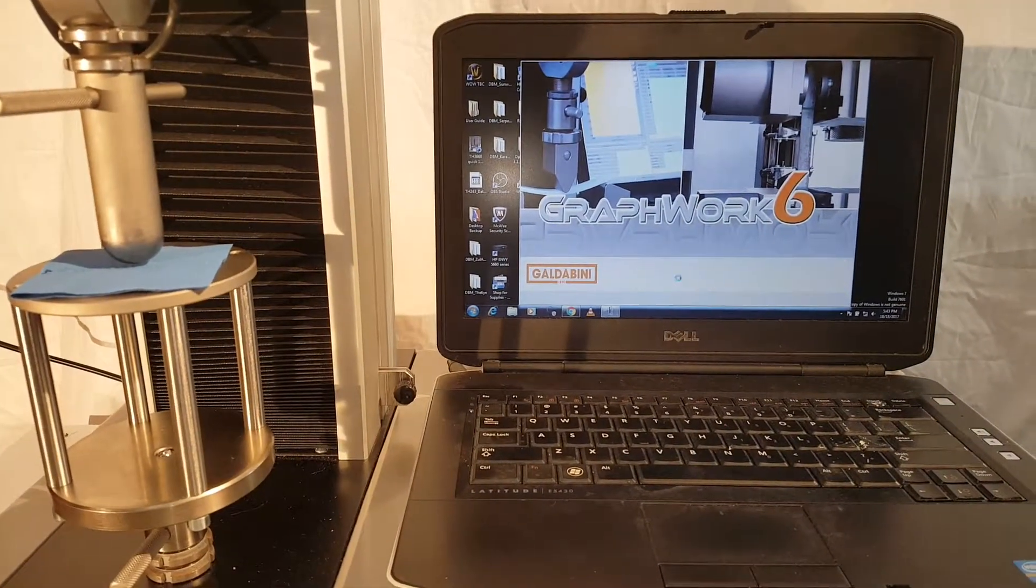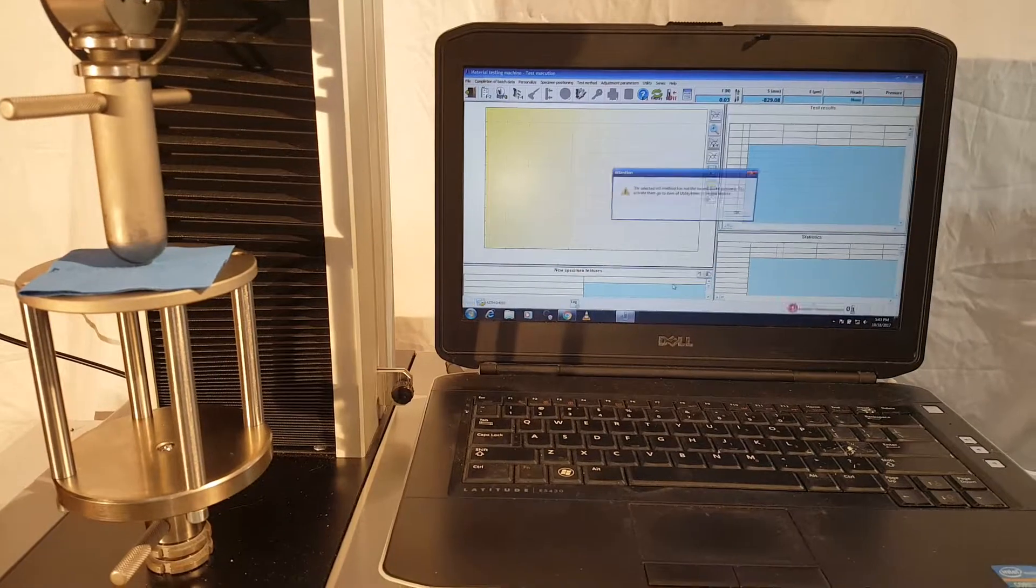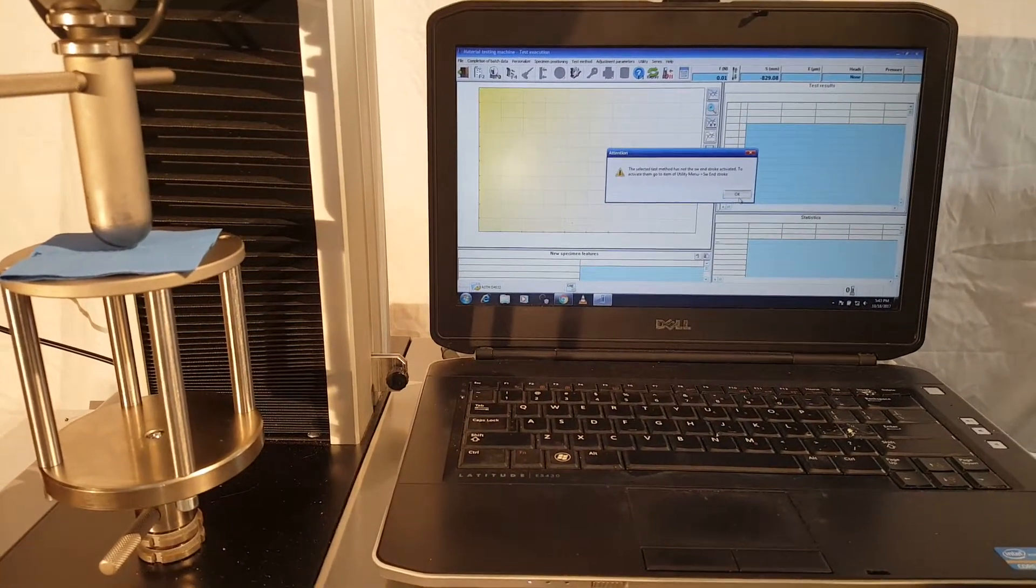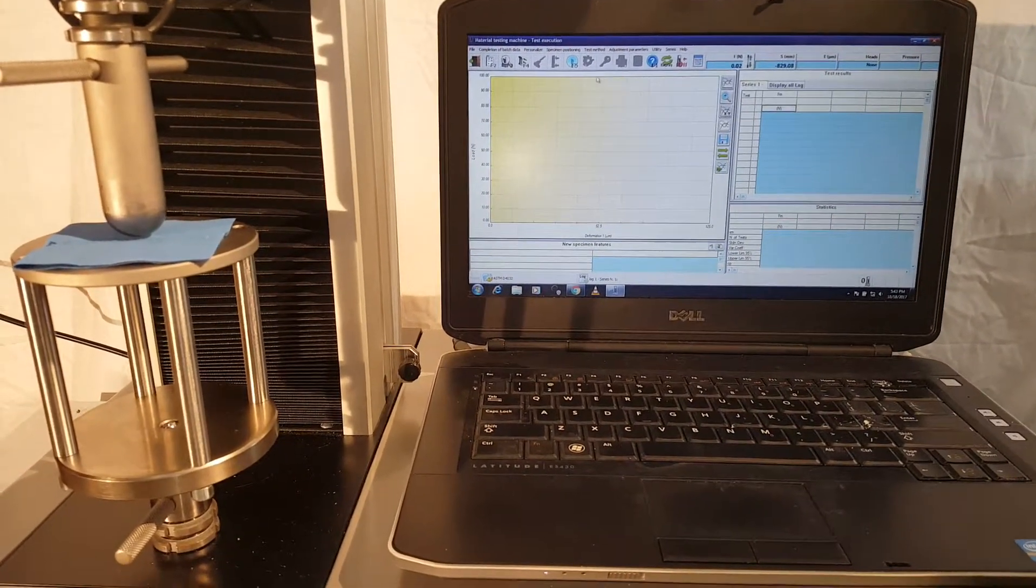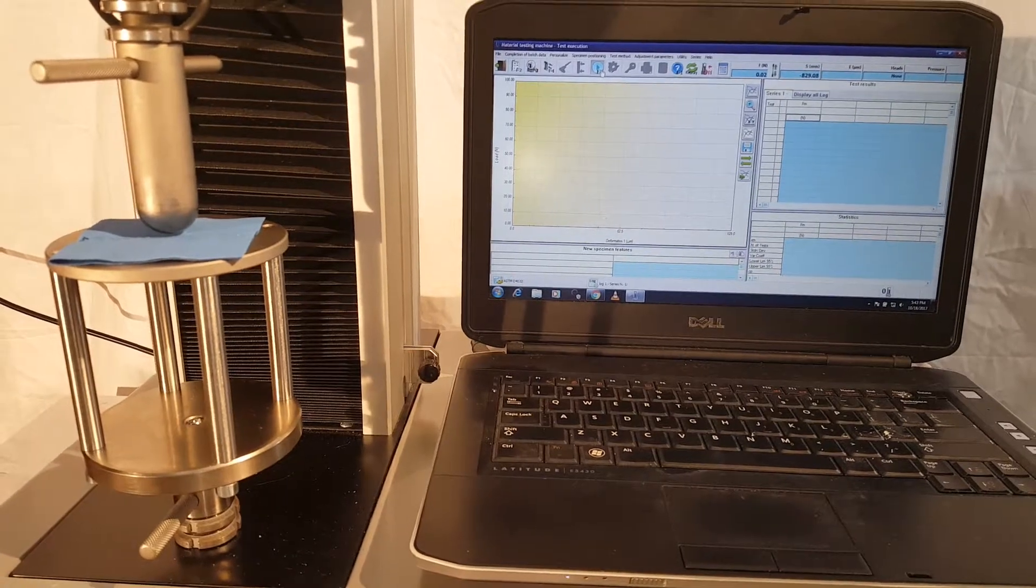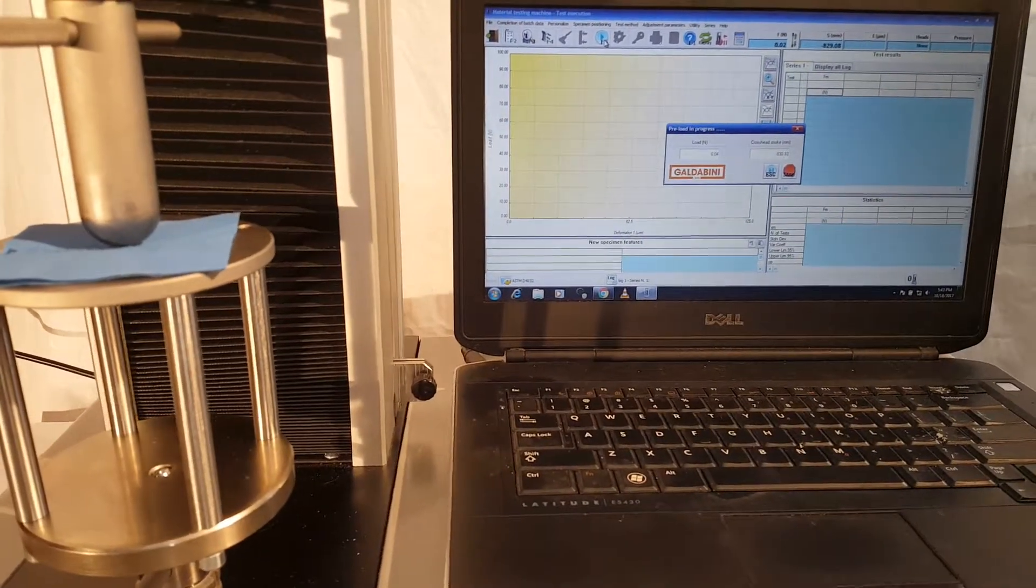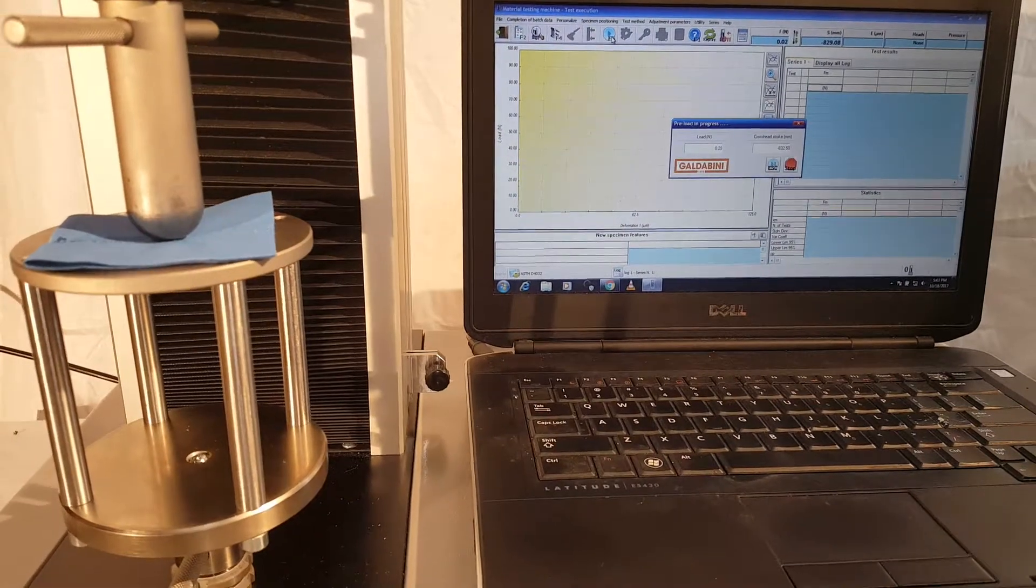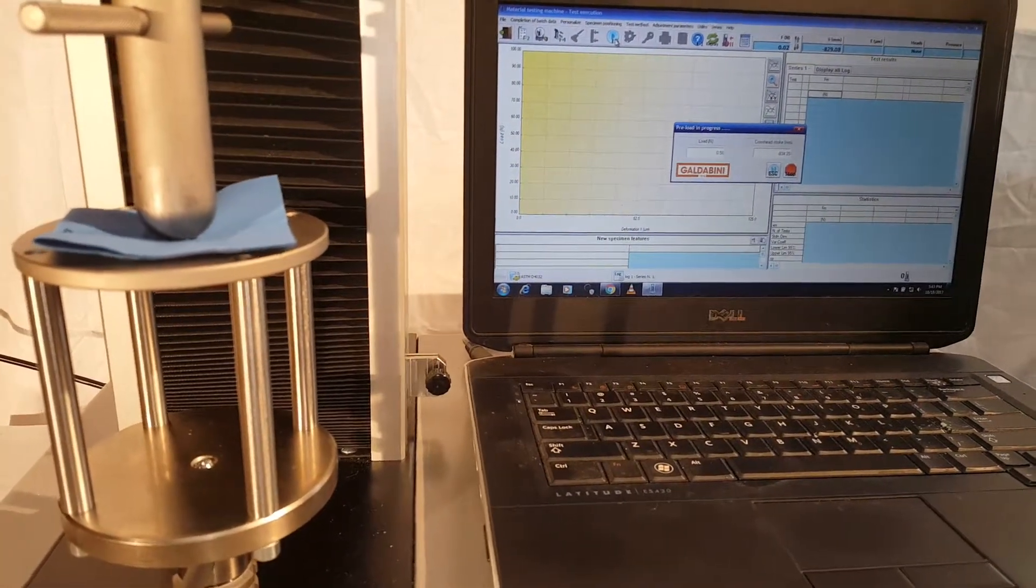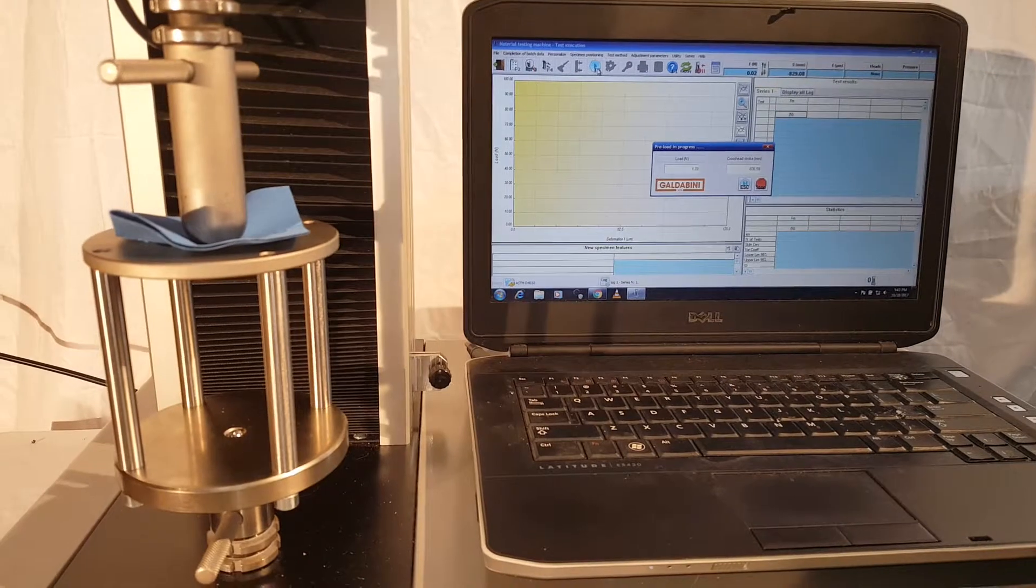I'll go into the test execution side of the software. I'm all set up so I'm going to go ahead and press play. I have it set to start with a 2 newton preload. It's going to put a slight preload on the sample before we start here.